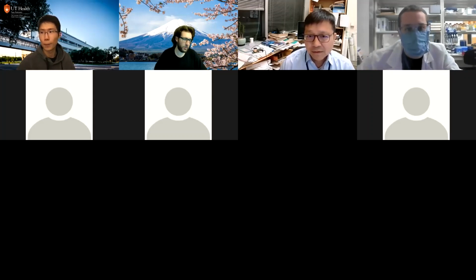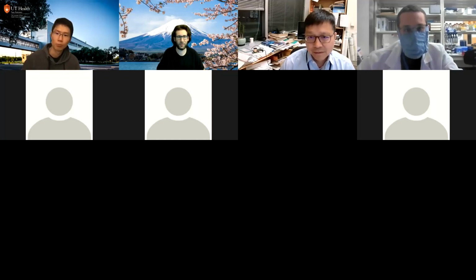Yeah, so it's got decimals, right? DESeq automatically deals with that when you use the DESeqDataSetFromTximport function. It also takes the transcript length into account, doing a bit of a correction for the library size based off tximport. So they actually work together. The authors of DESeq work together with the authors of tximport. Some of them are actually the same people. They figured out a way to optimize that for DESeq, which is why I like to recommend it.